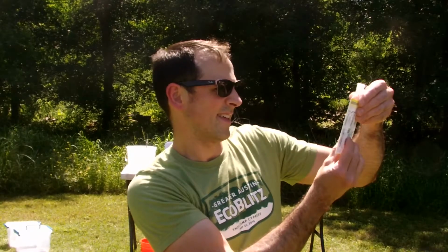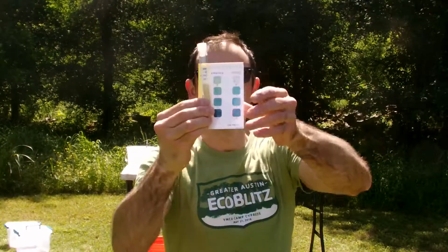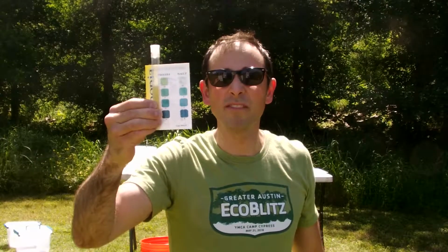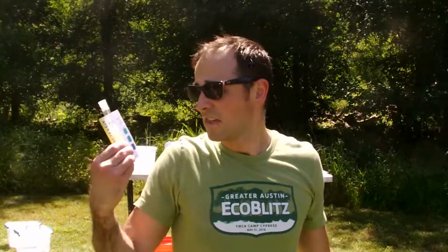It's pretty green. What do you think, class? Maybe like a 0.5? You know? Not quite fully green, but not quite teal on the one, so maybe a 0.5, 0.75. The kids can record however they want to, 0.5, 0.75. If they think it's a 0, whatever, it doesn't matter. They might get some different answers. That's A-okay, all right? So once again, have them record it on their sheet. This is something they're taking home with them. So I'll be back with the next couple tests, and that will include our water chemistry.